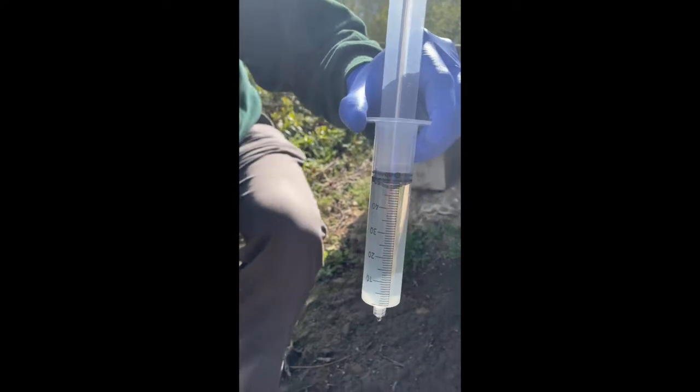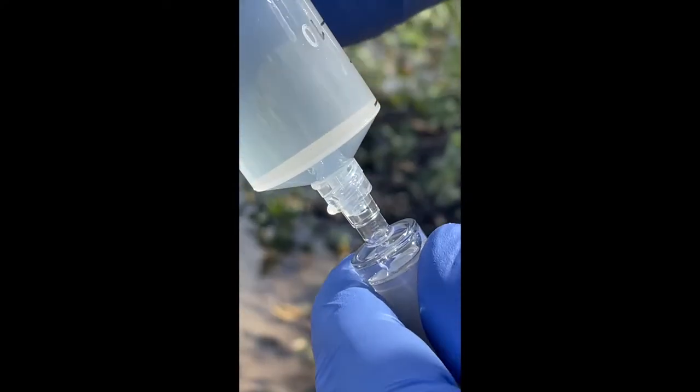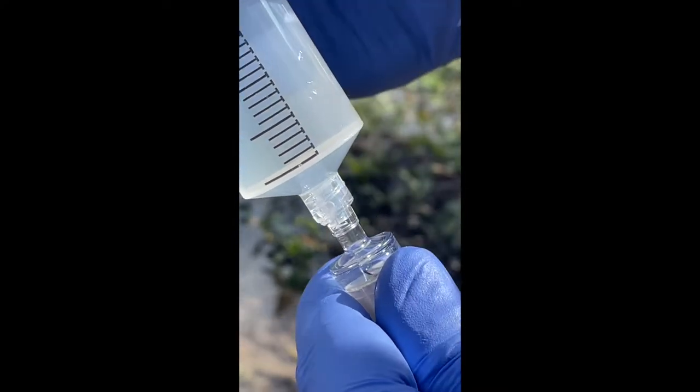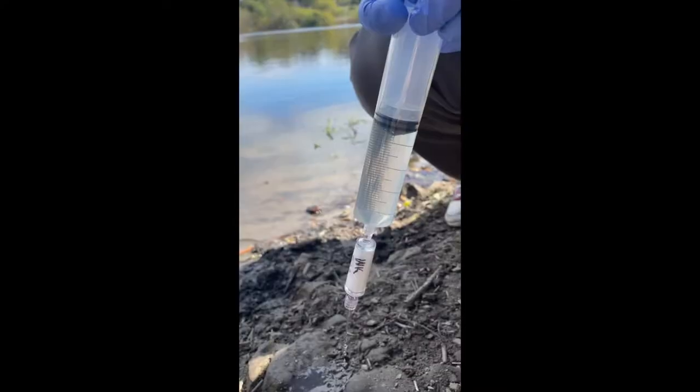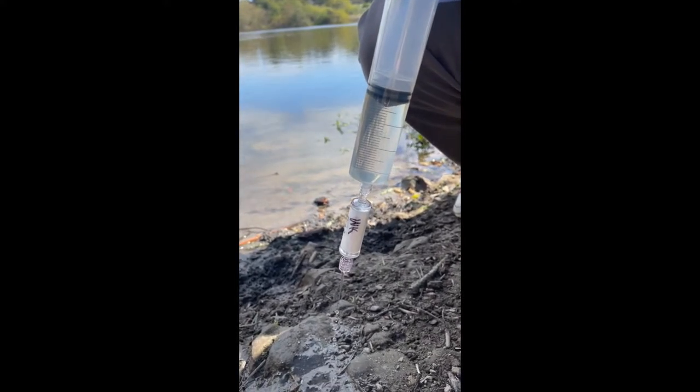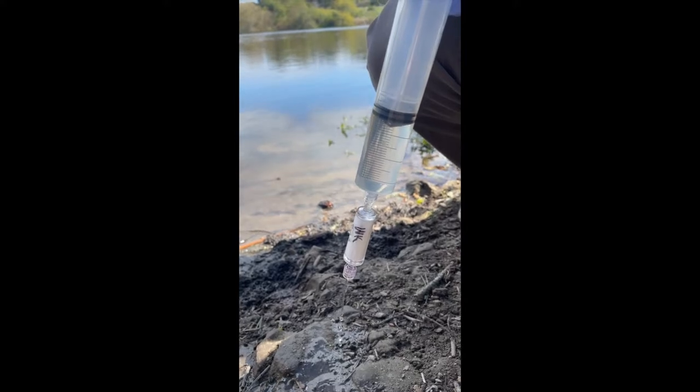Take the Sterivex filter unit and gently screw it onto the edge of the syringe, then gently push water through the filter. Repeat this as many times as possible until the filter no longer pushes water through.